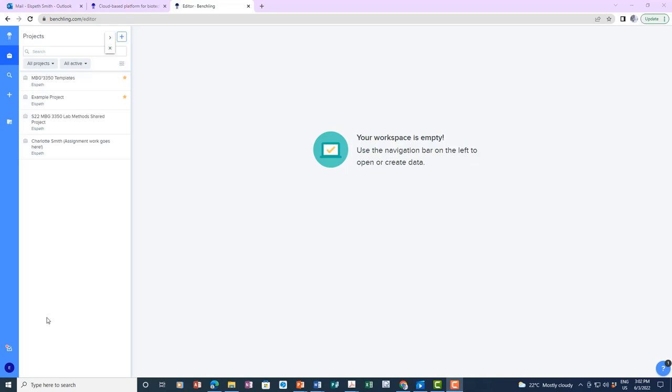In this video, I'm going to show you guys how to upload a new DNA sequence into Benchling and then how to attach primers to that sequence for virtual PCR. If you guys would like to know how to design primers from scratch in Benchling, there's actually another video that you can check out that covers that.